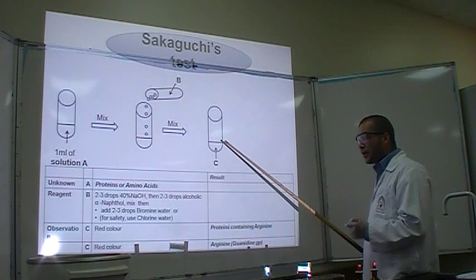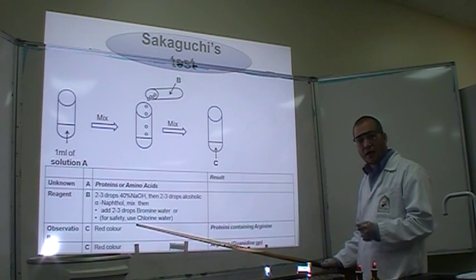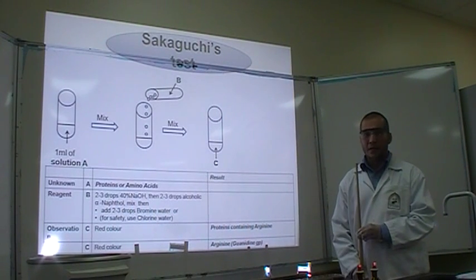And what are you going to get here? You're going to get red color. So, now, let's do the experiment.